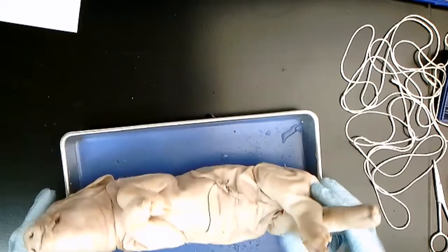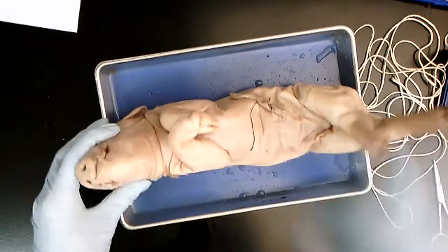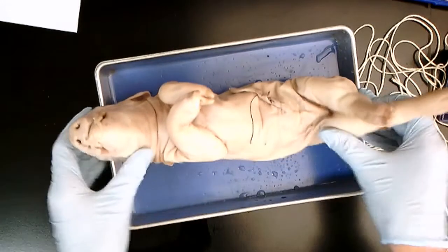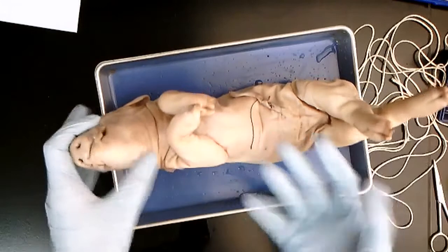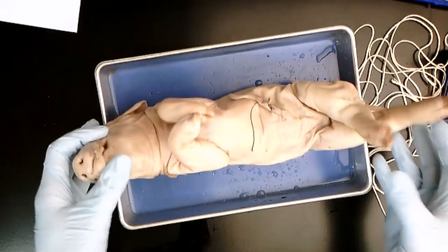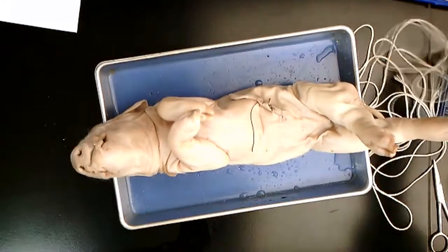All right. Face it down. You bet. Okay. So let's see where the pig is. All right. So what you want to do is you want to set the fetal pig ventral side up, so laying on its back where its stomach is facing up. We have very small dissection trays for this size of pig. These are the trays that are going to be at the contest.